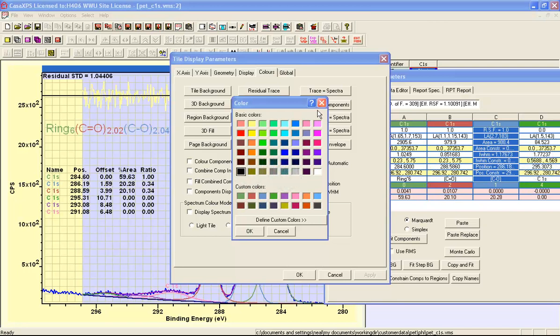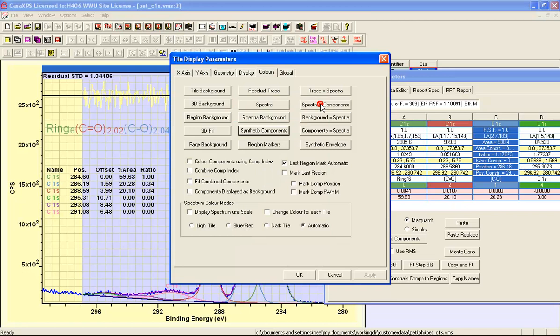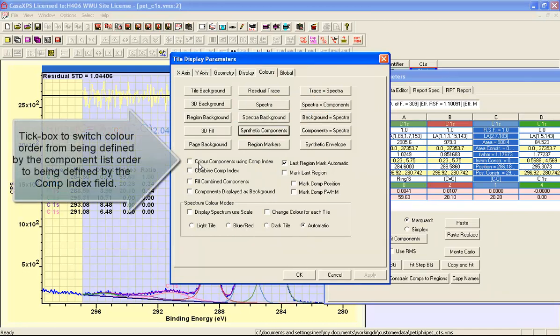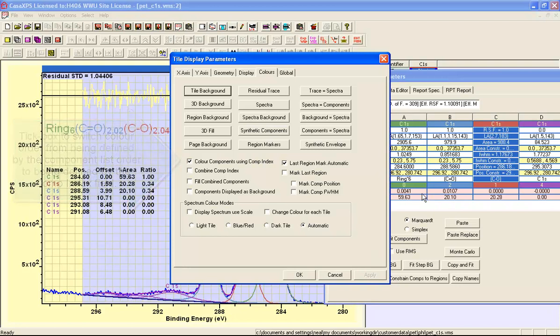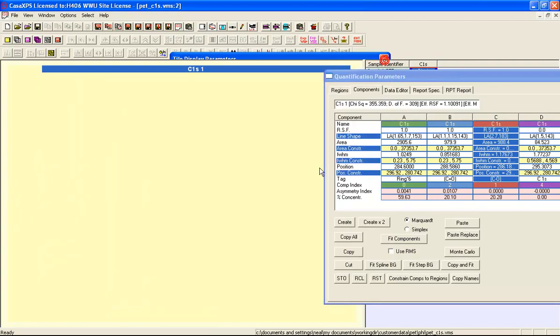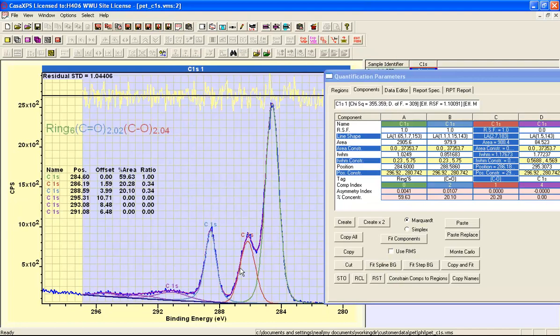If I wish to enable these colors then there is an option here on the colors property page that says color components using component index. If I tick this and press apply then you can see that the colors here change and similarly the colors in the display have changed.